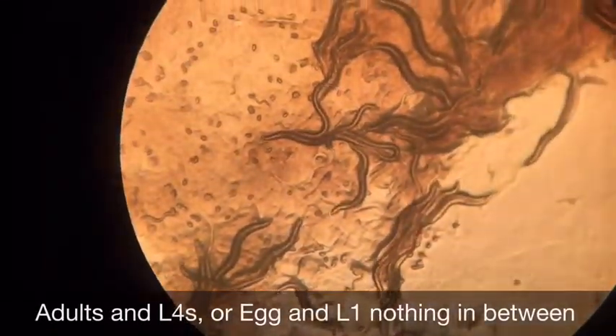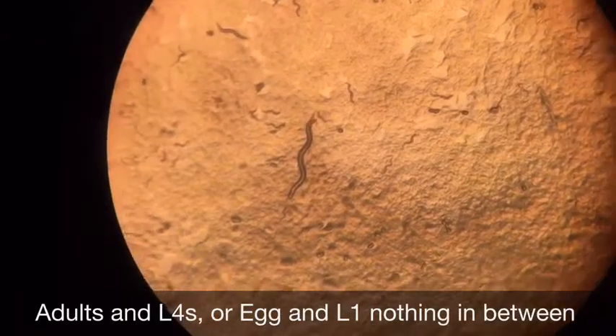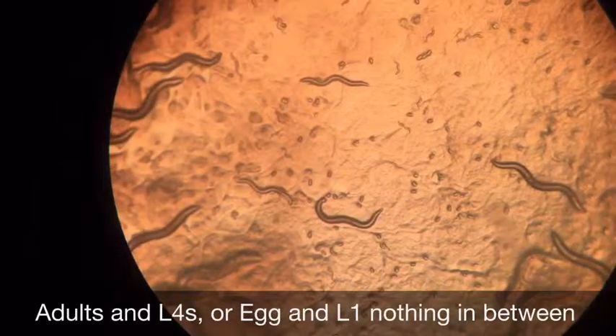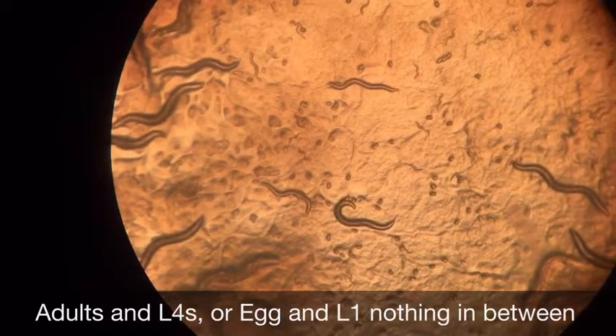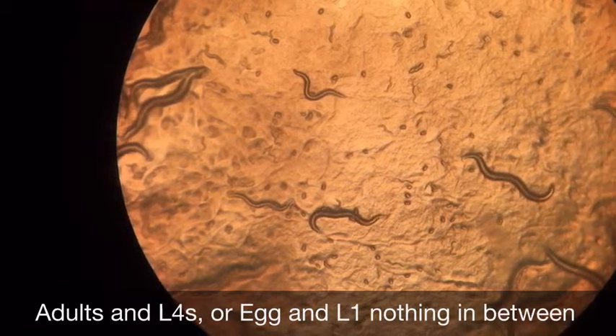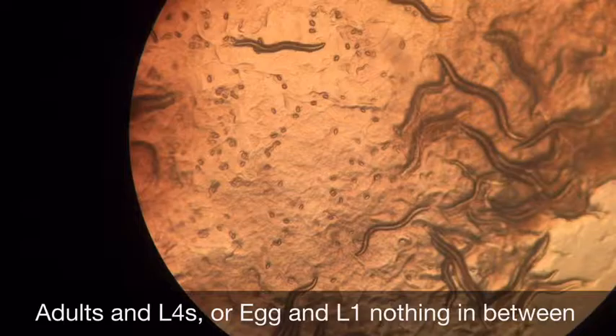This video is of our results on the first day after being in the incubating fridge for 4 days at 16 degrees Celsius. Our results were different than what we were supposed to have. We were supposed to have the ROL-6 gene, but we were sent the wrong gene and got the POS1 gene. In this video, worms had a life cycle mutation that caused them to either shrink or grow. In this video, you can mainly see adults, L4s, eggs, or L1s.